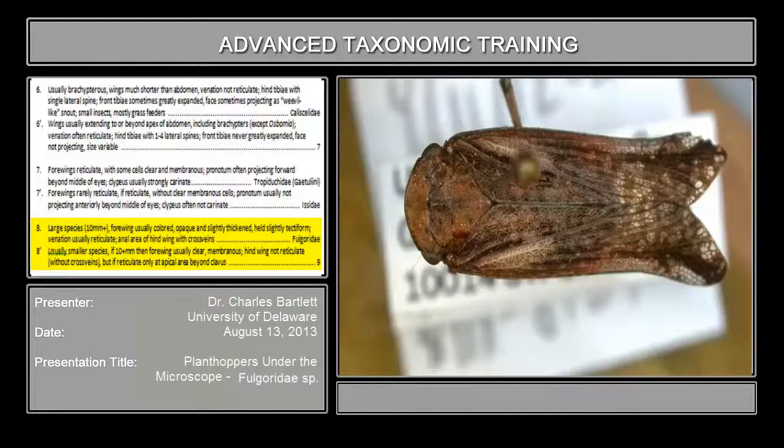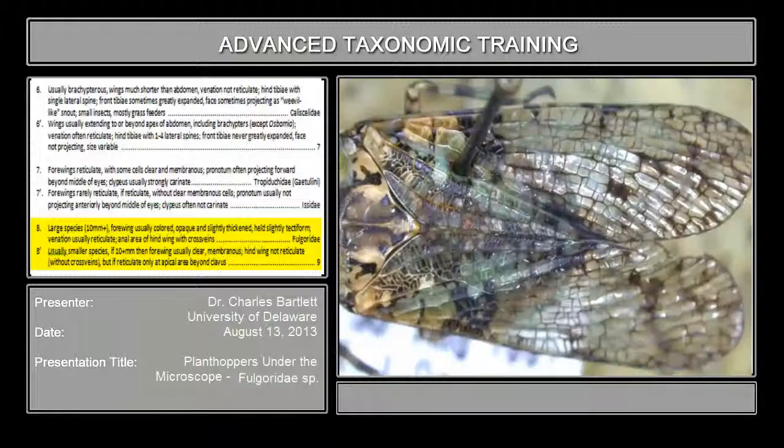Opaque and slightly thickened — yes, that's opaque, and it's also slightly thickened, slightly tectiform. Venation is usually reticulate. You can see in either of these specimens that the wing venation has lots of little cross veins, so that is what we mean by reticulate. Here we are with all those little cross veins — once again, that is reticulate.